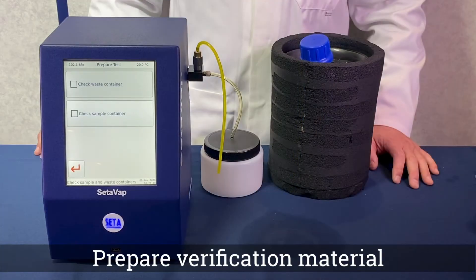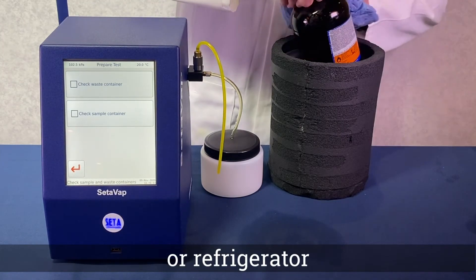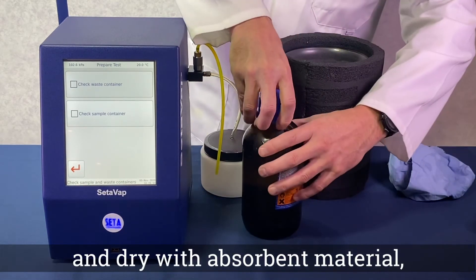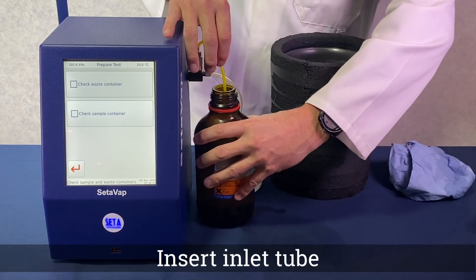Having prepared your verification material in accordance with the test method, remove the sample from the cooling bath or refrigerator. Dry the exterior with absorbent material ensuring the container is 70-80% full. Immediately insert the inlet tube.